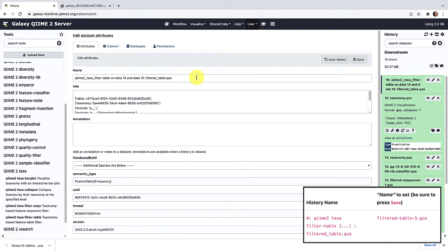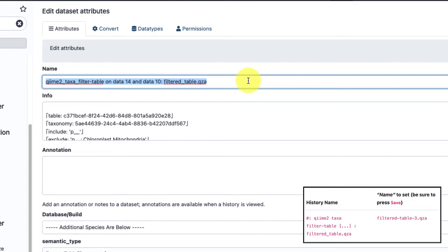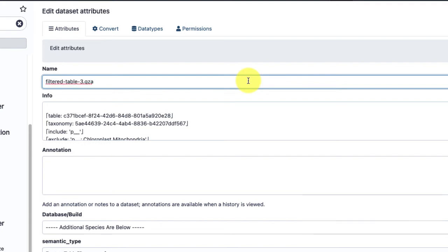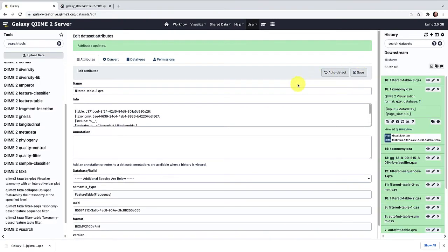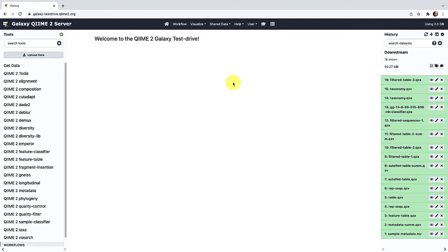Now that our taxonomy-based filtering is complete, let's go ahead and rename our table. We're going to call it filtered-table-3 and click Save. Now that we've finished filtering based on our taxonomy, let's move on to an additional filtering step — we are going to be removing samples with low ASV sequence counts. Samples with low sequence counts often are samples that do not amplify or sequence well, and when we move on to visualizing our data, these can often produce misleading results because the observed composition often differs from the actual sample composition. We are going to be filtering to a threshold of 10,000 sequences in a sample.